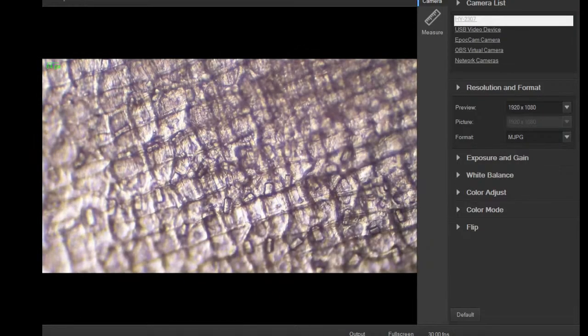See if I could change the lighting a bit on it here. It's more of a dark field approach to it. Even though it's not totally dark, it's more contrasty. It's pretty wild. Pretty wild. Alright, so that's garlic skin, little papery bits.